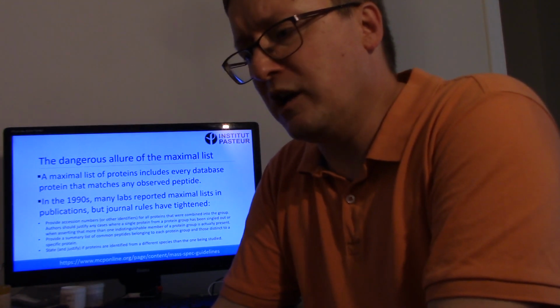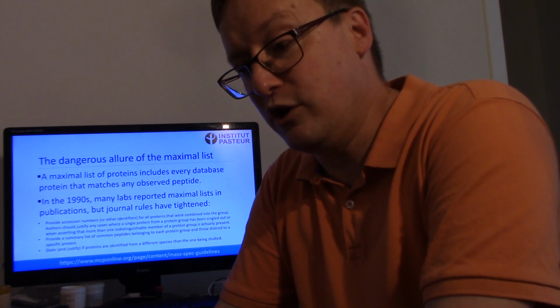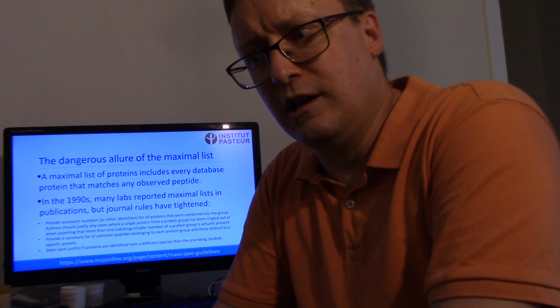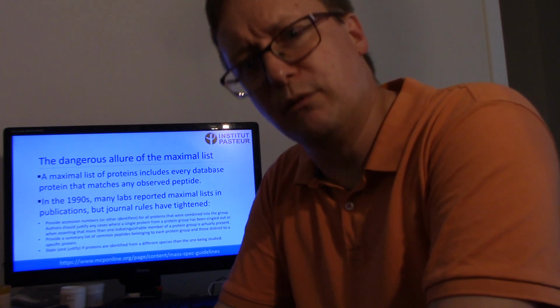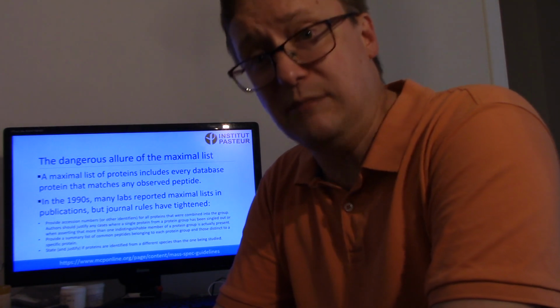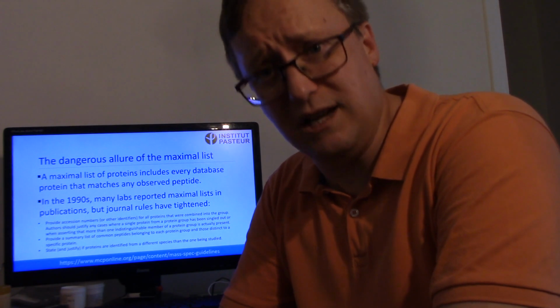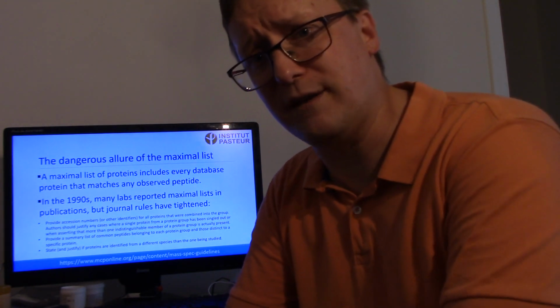Now, I would like to talk about the bad old days, and I would note that I've been in the field of proteomics since 1996. And back in the late 90s, things were running amok. They were not going well, because a lot of people would look at exactly the same data and come up with completely different visions of which protein sequences had been successfully identified.